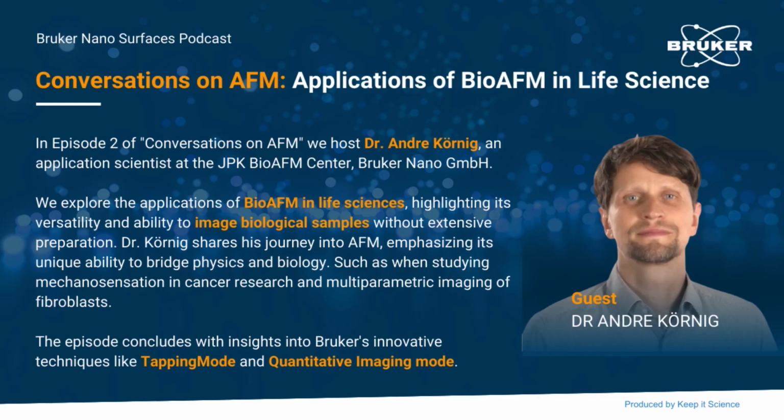But maybe can you talk also a little bit about what challenges there are, in comparison, for example, to material sciences? Like you said, in material sciences we mainly look at small molecules, and BioAFM is more like large structures, which might have more movement and are in vivo. But what other challenges are there that we could think about?